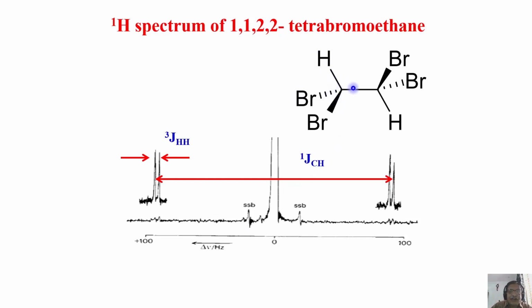Now I consider this carbon in the state of carbon 13. If this carbon exists as carbon 13, now it is no more A2. Symmetry is broken. Then what do you call it? Because the coupling exists, now it is A prime coupling. They are chemically equivalent, but coupling also exists. Now it will become AA prime X coupling. Why do I call it AA prime X? Because AX coupling and A prime X couplings are different. So it cannot be A2 now. It has to be an AA prime X spin system.